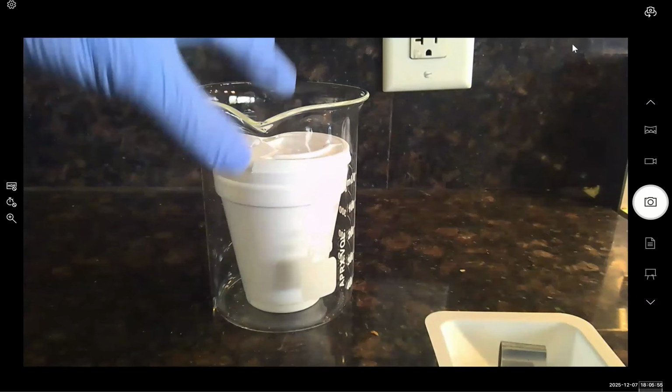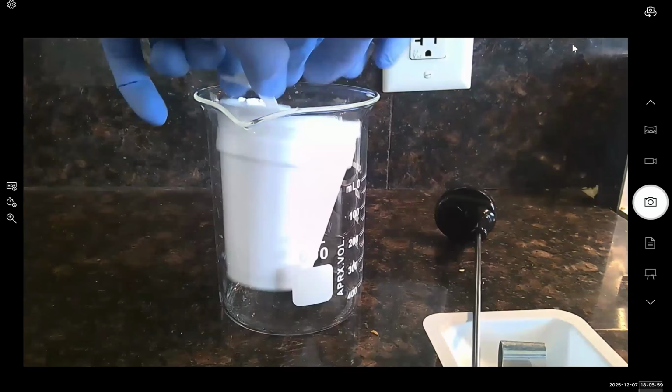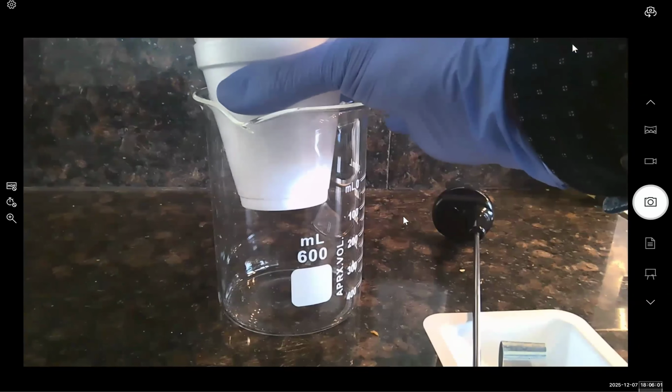Okay, we're now ready to start the process of heating the metal piece and recording the temperature of the boiling water bath.